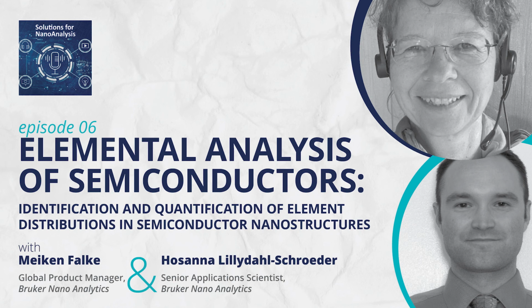And this combination or collaboration between manufacturers of microscopes and manufacturers of EDS is important for the future of the technique, for being able to find elements on the nanometer and atomic scale within seconds and not waiting hours to analyze, for instance, doping levels.